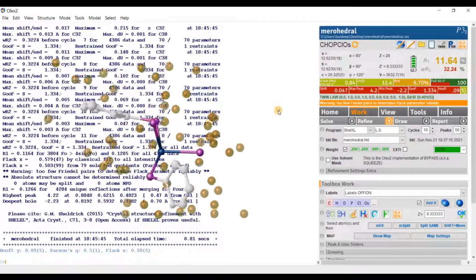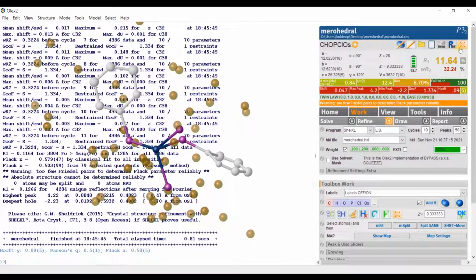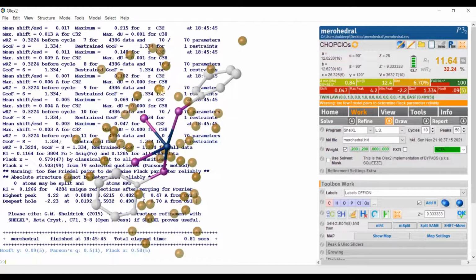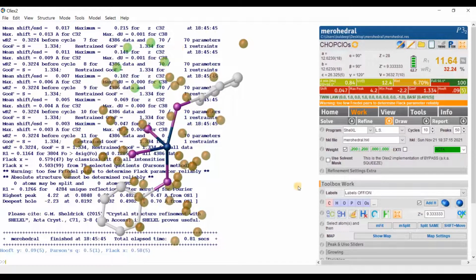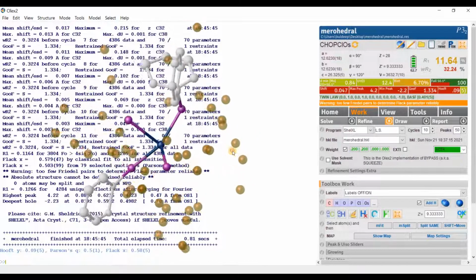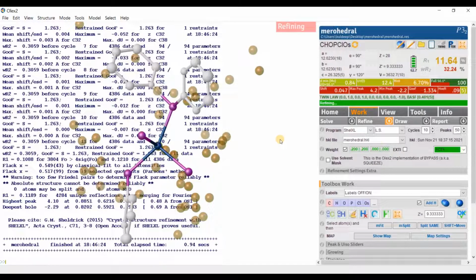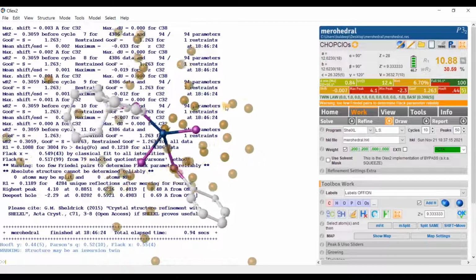Now, if I closely look at the electron density map, okay, press this button. Okay, let's see for some other benzene ring. Oh yes, here it is visible very nicely. 1, 2, 3, 4, 5 and 6. Name them carbon. Good. Is there any other ring? Okay, just refine for now. Do it step by step and you will find the next ring in the next refinement cycle.